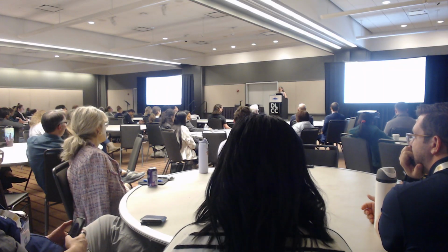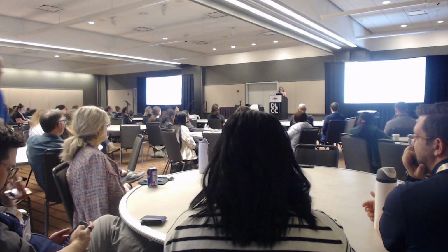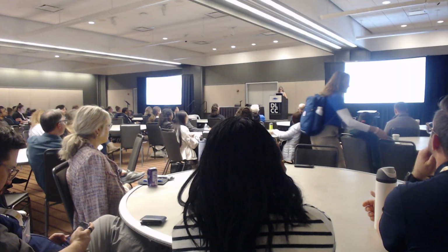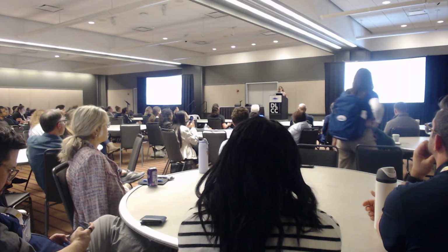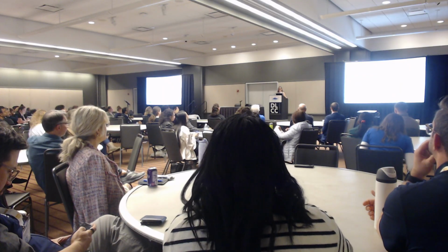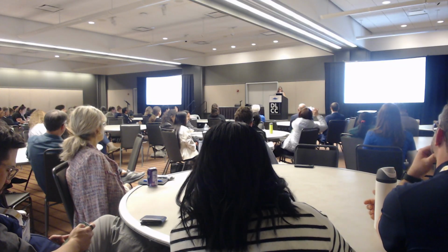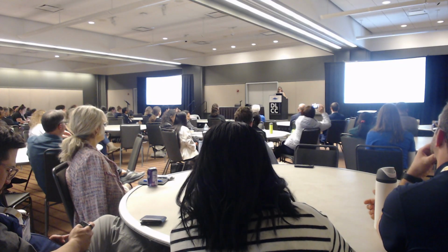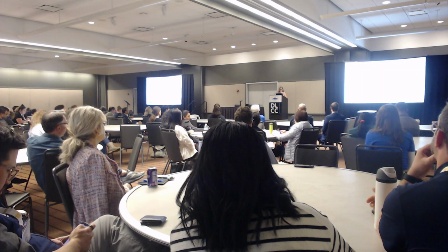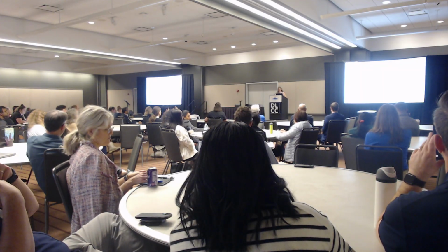But in the last couple of years, there has been an expansion in all of the different assays that are possible to offer, going from cytosine modifications to chromatin organization, even just looking at protein-DNA interactions. We are now also entering the field of spatial. And you can also have a combination of all of these different aspects in the same assay. So it becomes a bit difficult to figure out, from my perspective, what would be worth it for the investigators and which assay would be most beneficial.